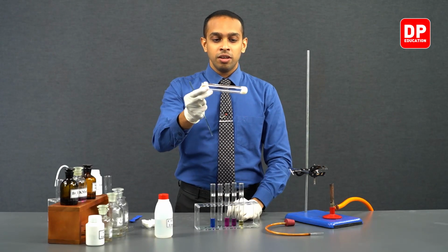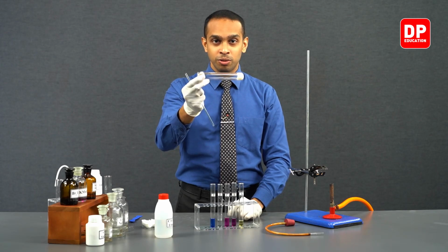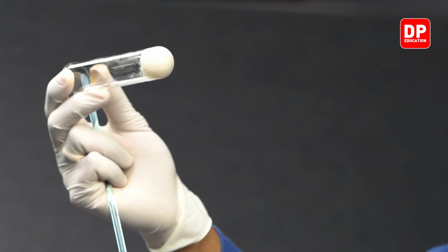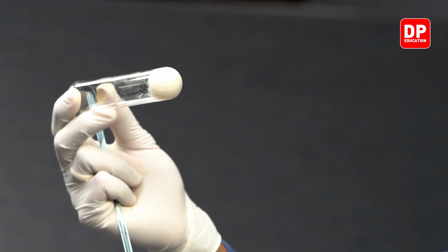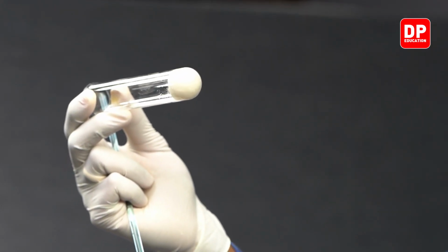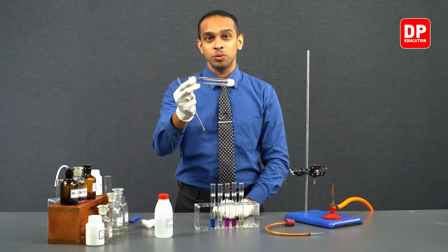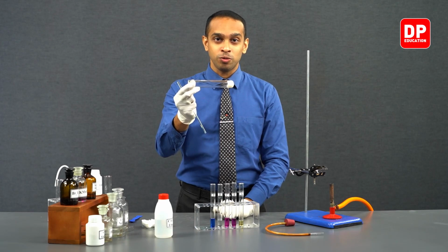Now students, when we turn the boiling tube, do you see any ethanol flowing towards the middle bit of our boiling tube? You do not. The reason for this is ethanol is soaked into or absorbed into the cotton wool.